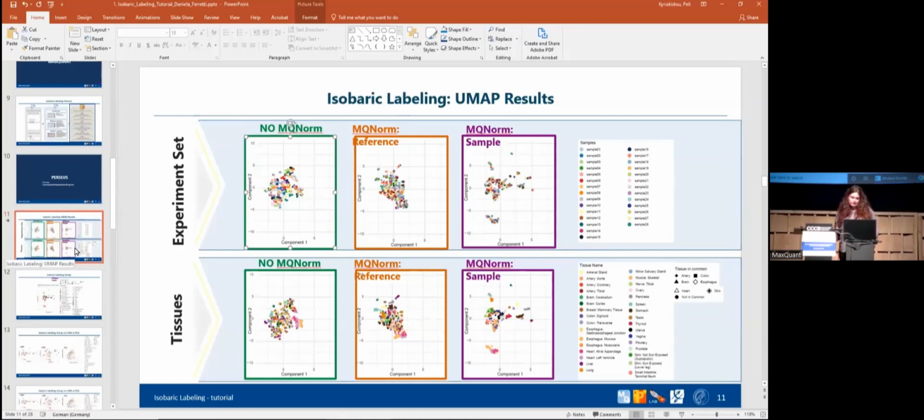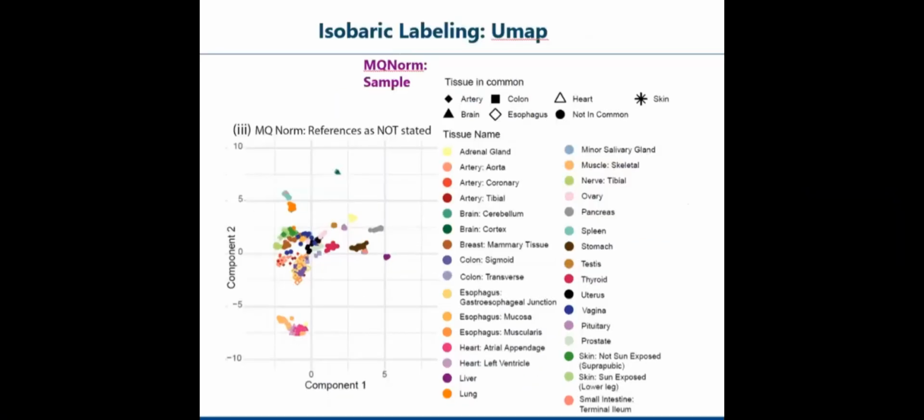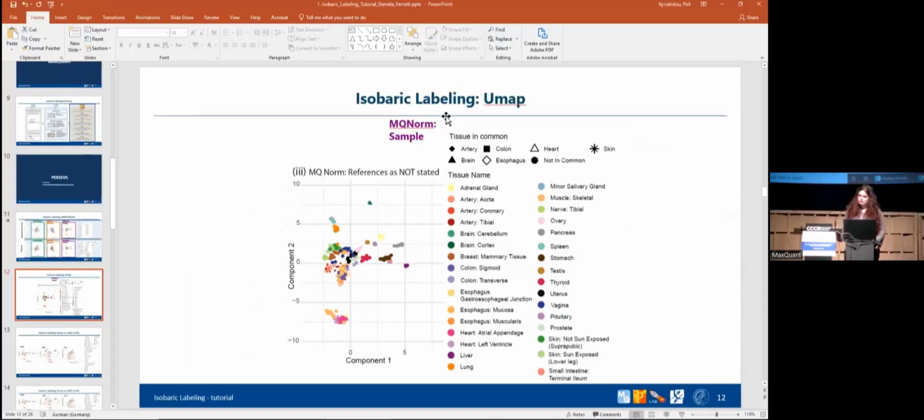Then, for the rest, I think I don't have time, but as I said, I gave you the output of this one. But you can do this one too. The raw files, please download from PRIDE, because I didn't provide that one because it was huge. But you will see that if you do that, you will get the same results. And yes, maybe add a zoom of the last one. You can see that it's pretty good. Thank you.